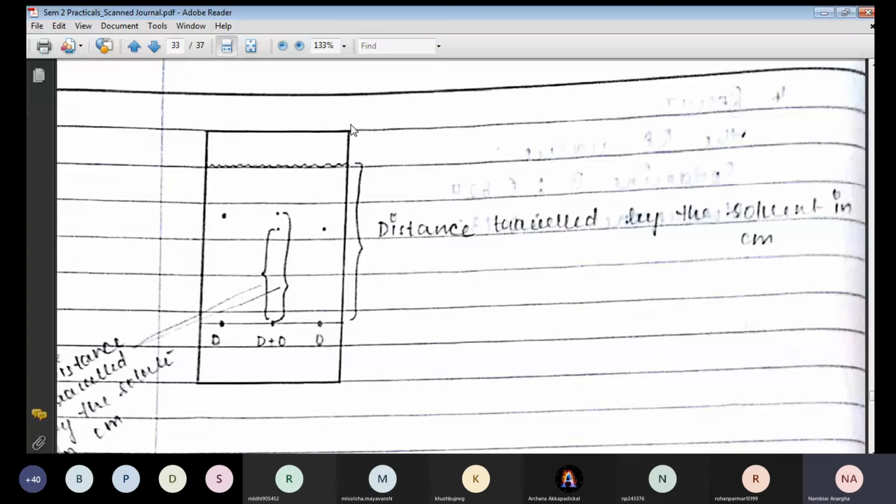The first question is, why do we use iodine chamber? Iodine chamber is used as a visualization system for drugs because iodine forms a complex with unsaturated or aromatic compounds. So that is the main reason we use iodine chamber here. We can also go for UV light. However, UV light is not feasible in our case, so the easily available technique was iodine chamber. So we go for iodine chamber.